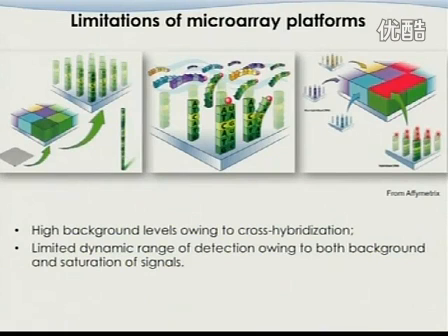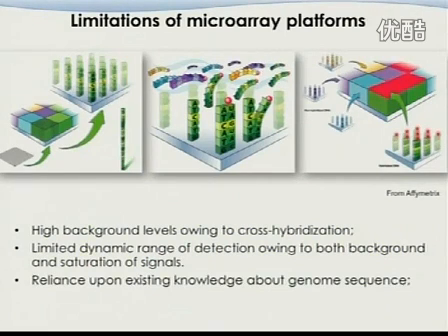You see that it is really, really bright. But in another condition, its expression level doubled, and what you will still see is that same big red dot, because the signal has already been saturated. This causes arrays to have a very limited dynamic range for detection.